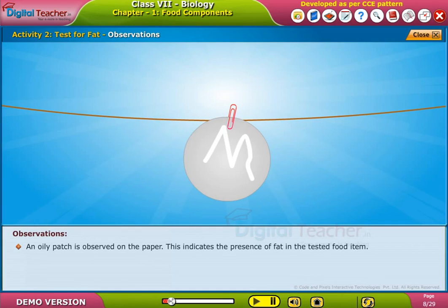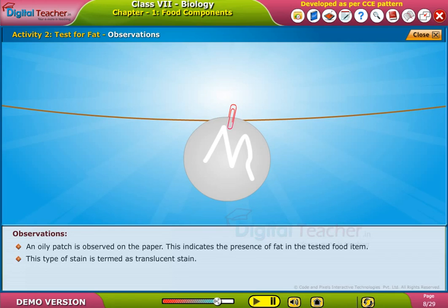An oily patch is observed on the paper. This indicates the presence of fat in the tested food item. This type of stain is termed a translucent stain.